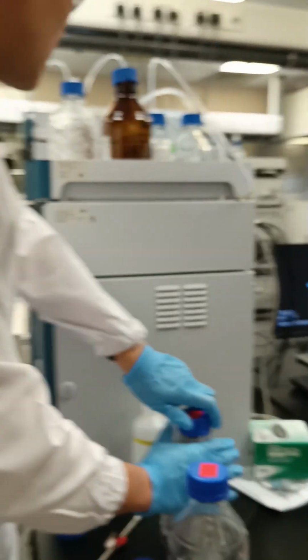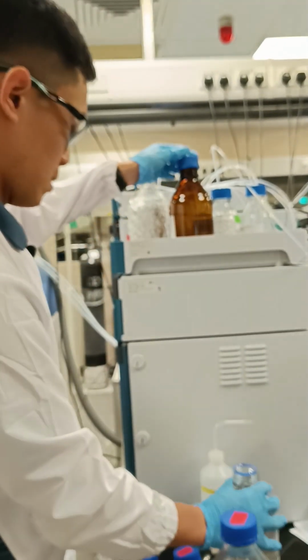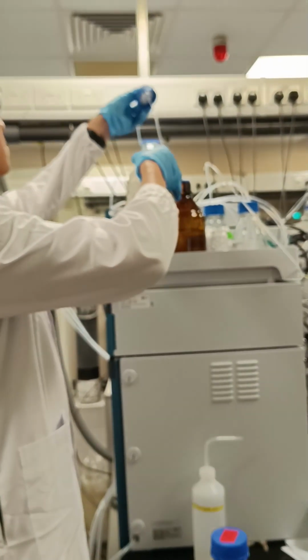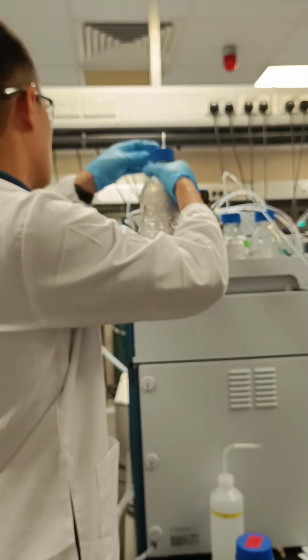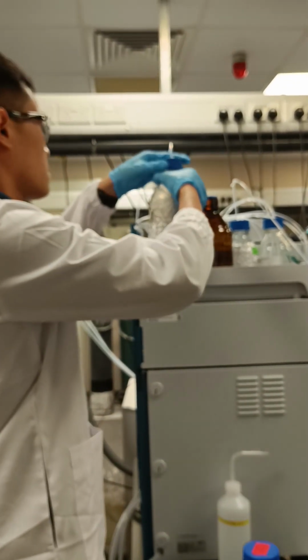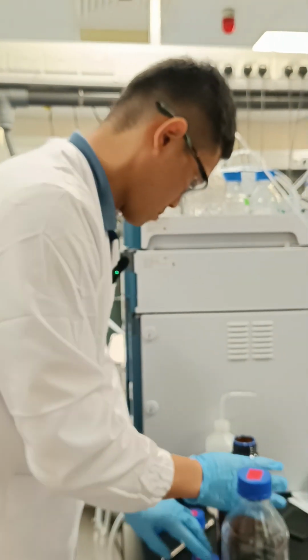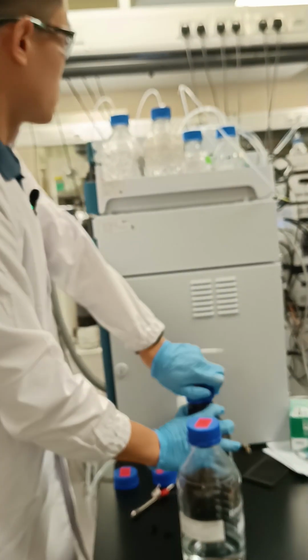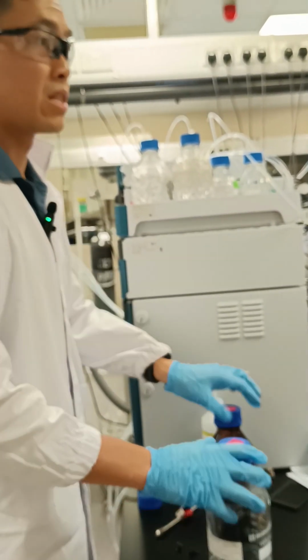Okay, then once this one has been done, this one needs to be changed as well. It's the same thing, pure ACN to ACN with 0.1% formic acid. This one we cover with aluminium foil to avoid the formic acid degrading.